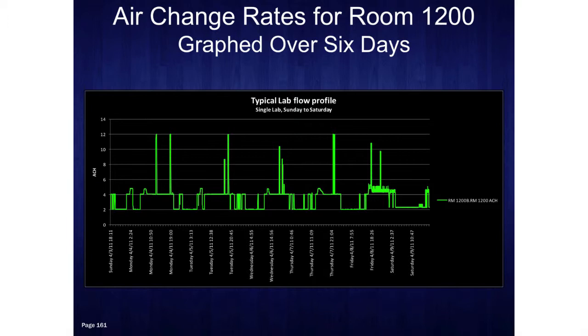They're not long-lasting. It's very, very short bursts of increased air change rates. But they're doing something, and it's not obviously being captured by a fume hood or a snorkel or one of those things. It's going into the general exhaust. So we go out to this space, myself and David, and we visit with the PI, and we said, excuse me, here's this graph that we have. We see all of these spikes taking place.